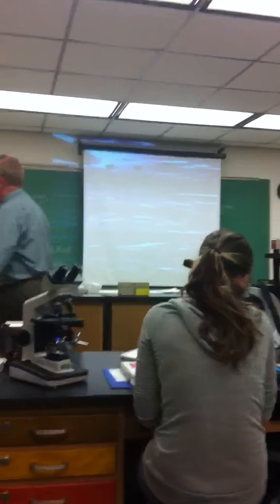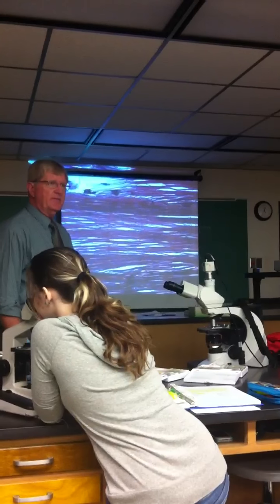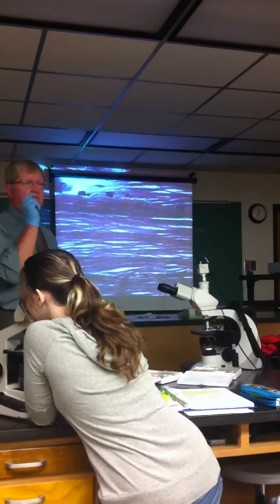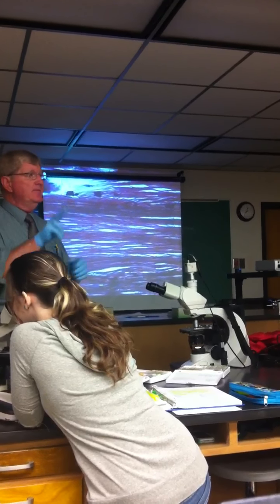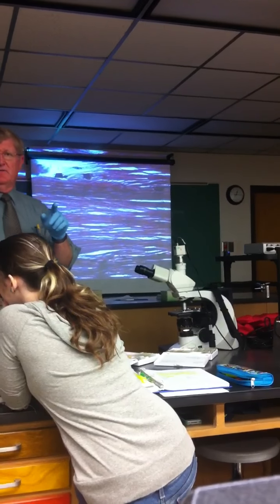Okay, now let's look at the real thing. If you saw this slide on the test, there ought to be a flashing blue light going off in your cerebral cortex saying what? Those are striations, so it has to be what? It's got to be muscle tissue. Now your cerebral cortex says, but you got two choices. What are the two?